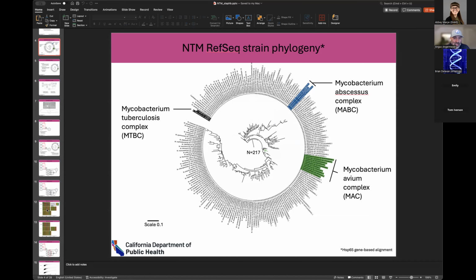What I was actually saying is that my colleague Swarthy has added tlyC as one of her big projects, to use it as this third gene to help with the diagnostic differentiation of the various NTM species. Historically, HSP65 and rpoB were used exclusively in an amplicon-based format to determine which NTM species you're looking at.